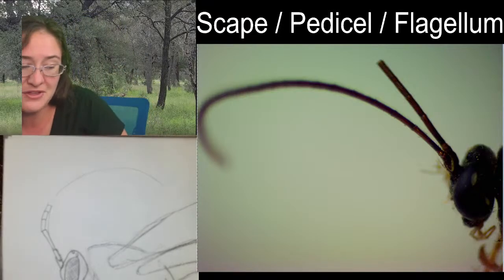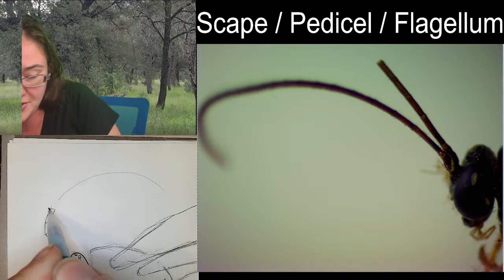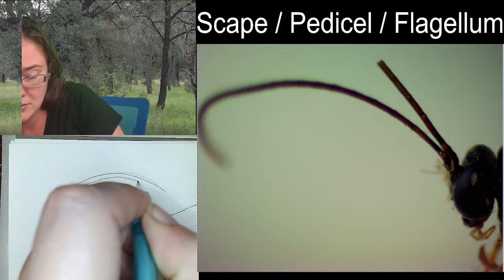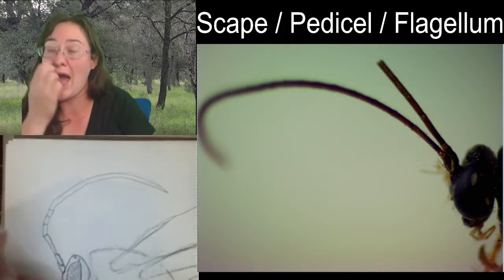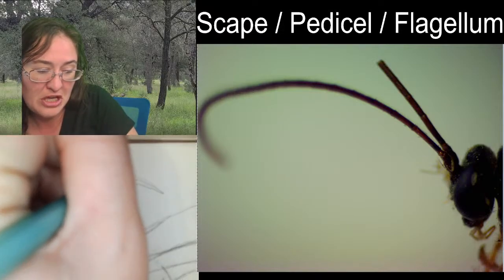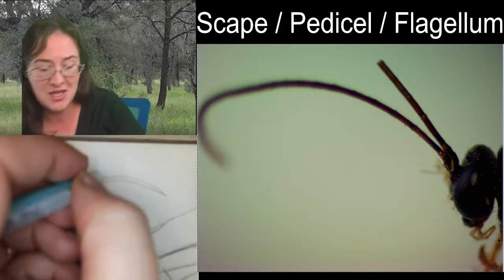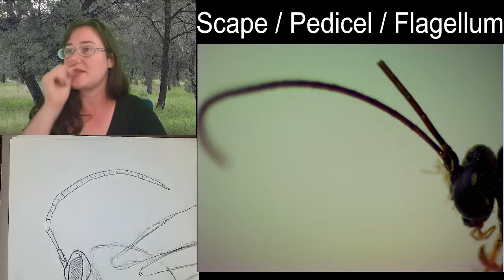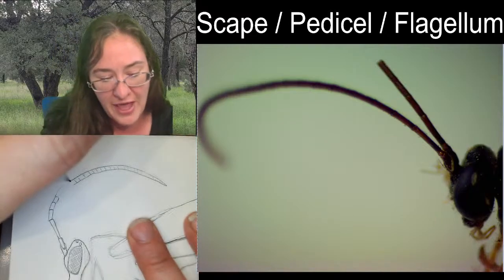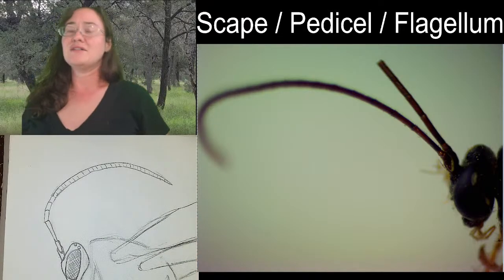You know what? Many of the segments almost look like they're filiform, or they're straight across. So what I'm going to do is just do it like this. And then I'm going to give all these crosses like this, because once you get to the end, there are many small segments. They start off pretty large, but by the time you get to the end of these antennae, they're really thin and small. And so that's kind of how I would like to sketch it today. It starts off with the first handful of them being fairly angulate, where you can see the edges in between them. But once it gets to the end, it's pretty straight.